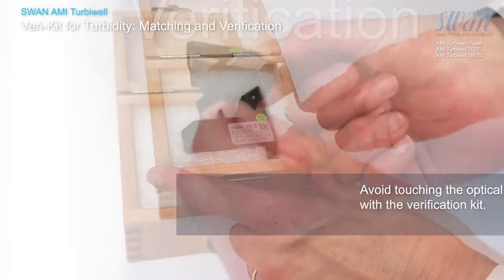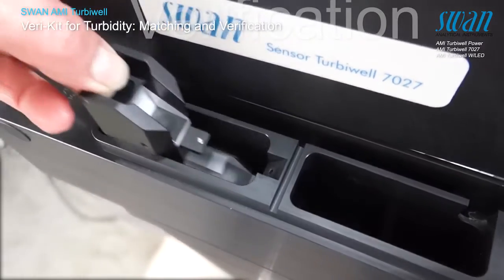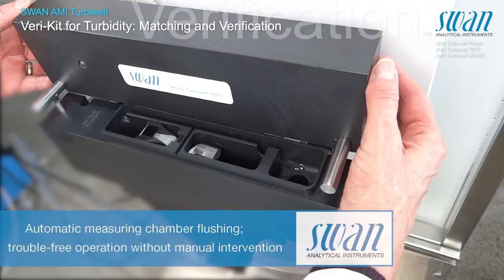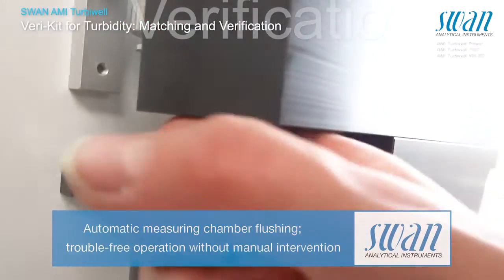To avoid misting of the glass prisms, make sure that the varikit and the measuring chamber have the same temperature. Insert the varikit and ensure that it is fastened correctly. Close the measuring chamber and start the verification by pressing enter.